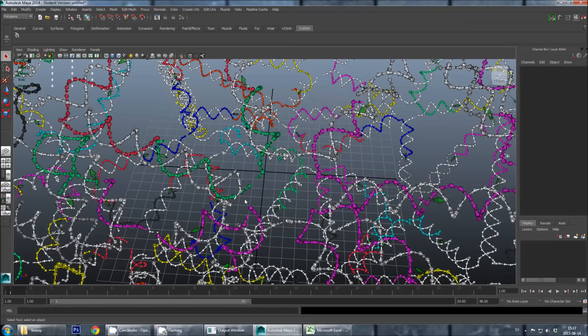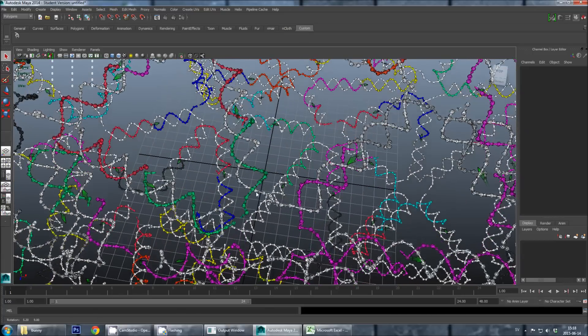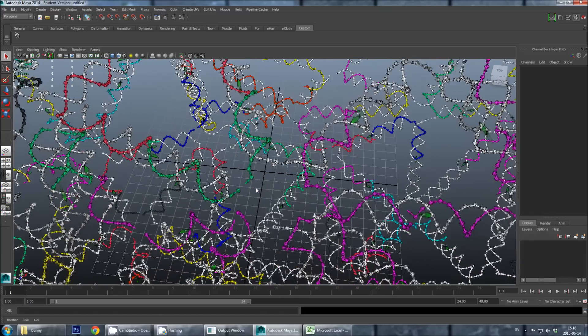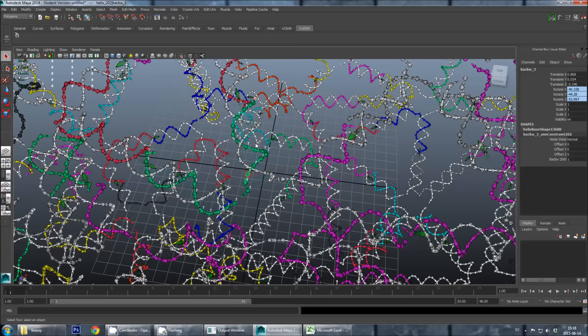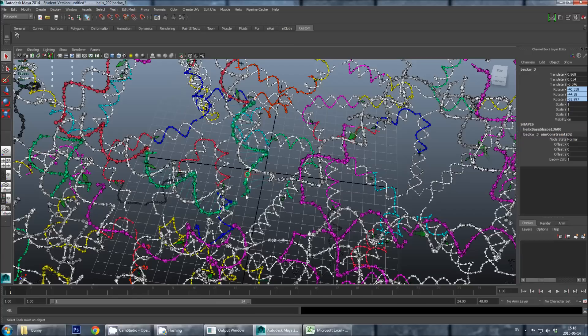As the last part of this tutorial I will discuss a feature that we have found to be important for folding quality. As you move around in V-Helix you may note that some strands appear to be interrupted. Like this green staple strand appears to have a nick in the center even though it is one connected strand. This is because V-Helix cannot place the helices tight enough in its representation. And this may lead to strain in the vertices in the final folding. And one way to overcome this is to fill the gaps in the strands with extra unpaired bases.